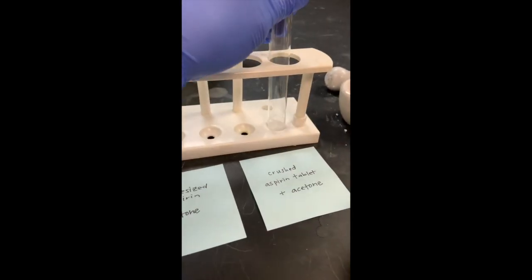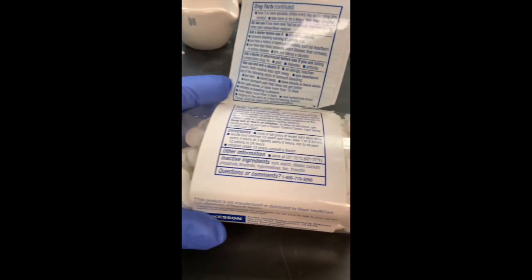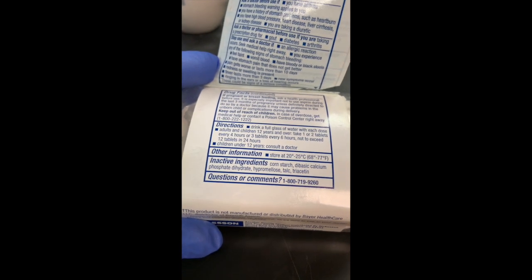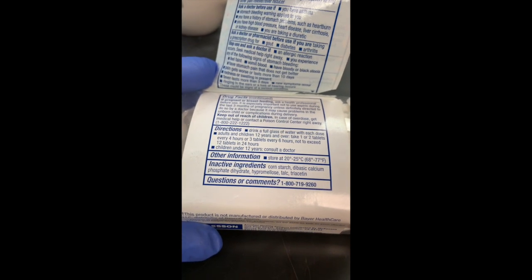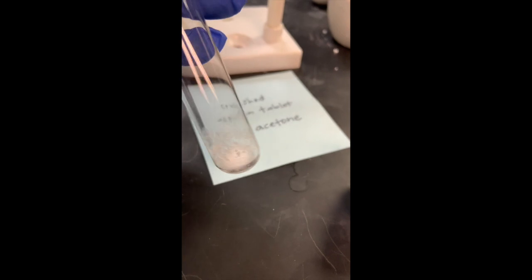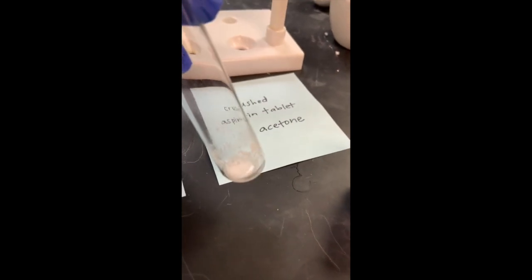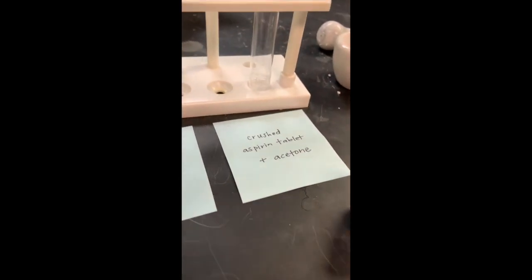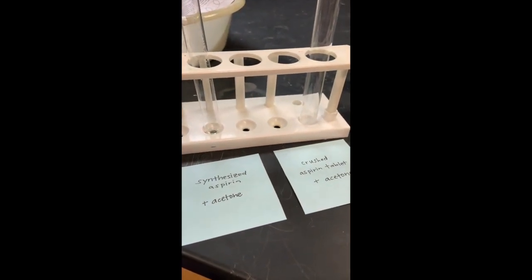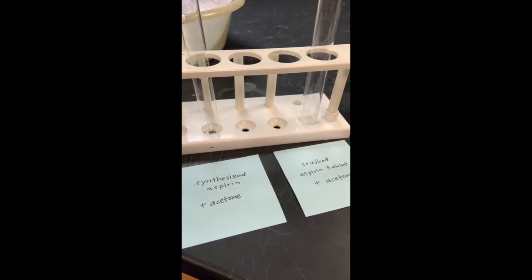So I looked at the ingredients of the aspirin tablet and it has cornstarch, talc, some other dibasic calcium phosphate. These are all inactive ingredients in my aspirin. So I'm wondering if the cornstarch, the talc, give me that residual white material there. But now I'm going to do a phenol test with my ferric chloride, and I'm going to actually do the phenol test on a piece of filter paper so it's easier to see.